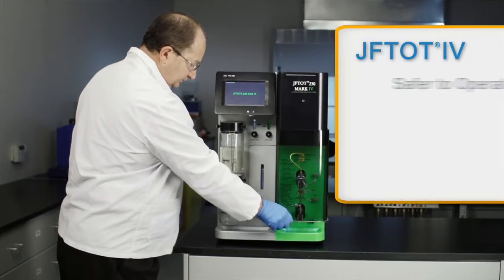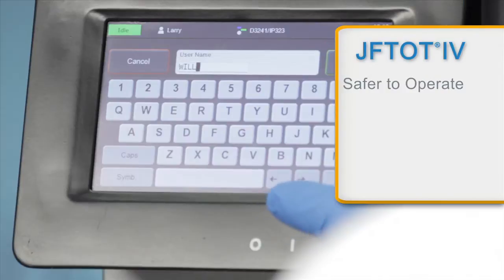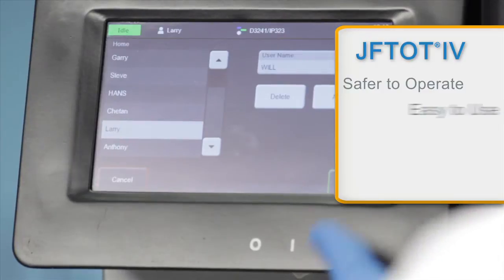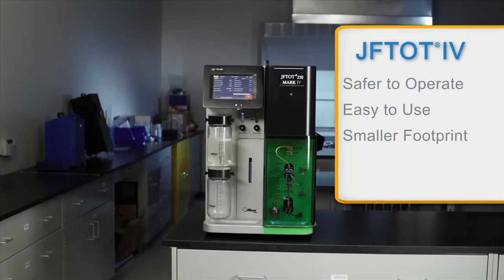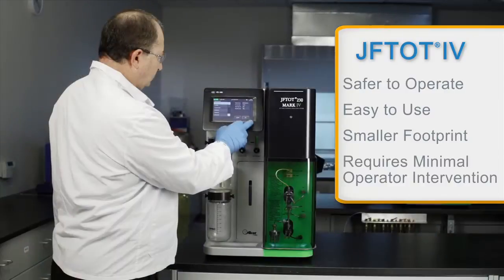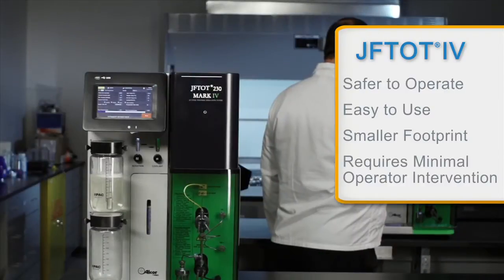Enhanced safety features make it safer to operate. Simplified operational capabilities make it easier to use. Smaller, streamlined packaging means it takes up less space in your lab. Automatic operation significantly increases operator productivity.